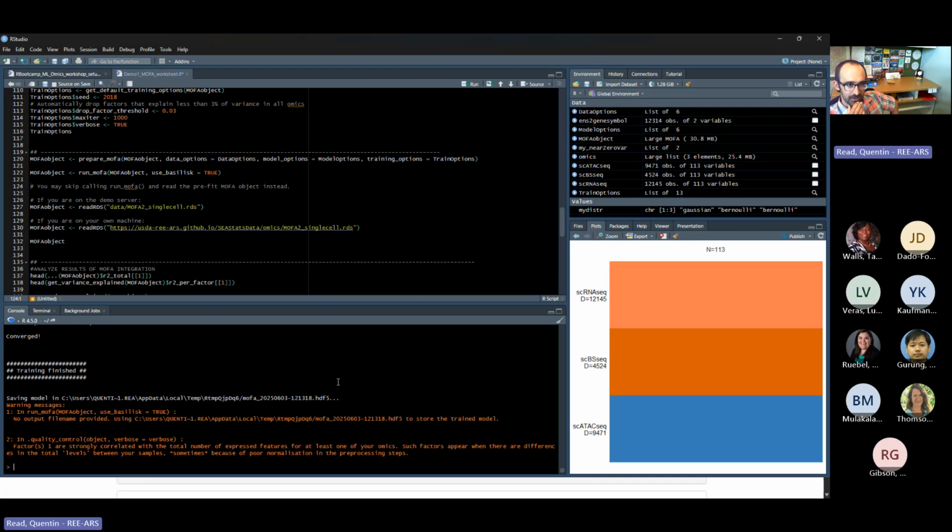normalize for particular cells having higher overall expression than others, which might be sort of a confounding variable in our results. So there are other transformations we could have done on the data that may have controlled for that better. But let's just not worry about that for today.